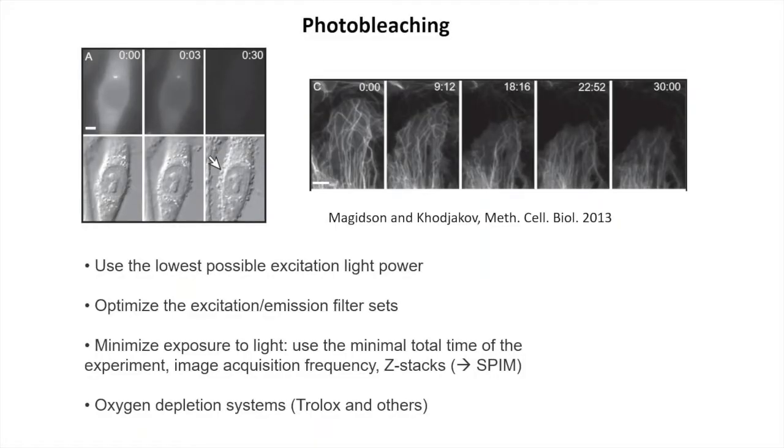As I mentioned, the main challenge and limitation of live microscopy is essentially photobleaching and phototoxicity, and this slide illustrates that. You have a fluorophore expressed, and after repetitive exposure to light, you see photobleaching. But most importantly, that also causes phototoxicity. So the cell is blebbing now. That is also really an important limitation. We really have to avoid these things and make sure that cells are happy and we don't lose signal, as shown here.